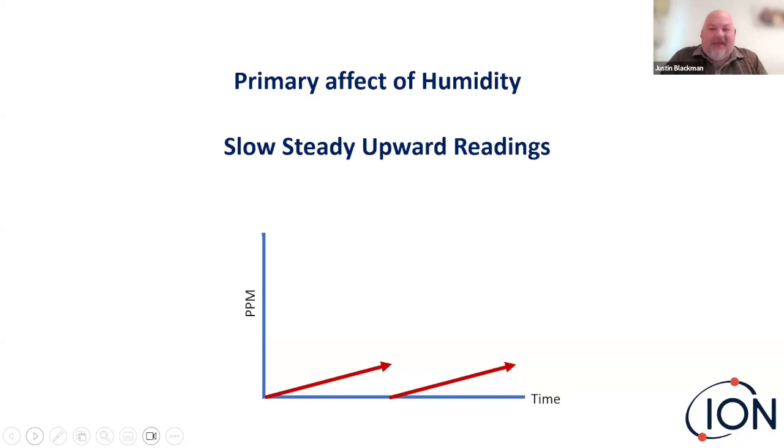Traditional PIDs were known to have problems in the field when there was high humidity around. We might say to ourselves, well, it's never high humidity where I am, it's only ever dry, what's the problem? However, if we are taking soil samples, we might put a few scoops of soil into a jar or a baggie.